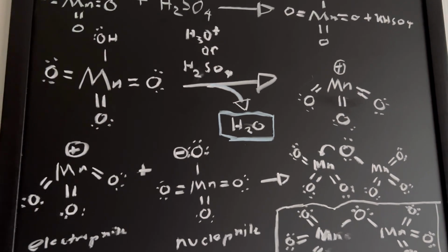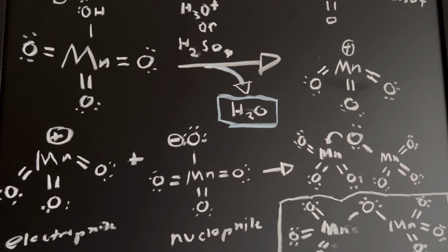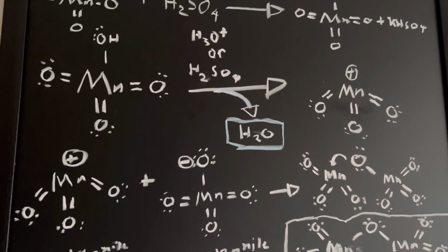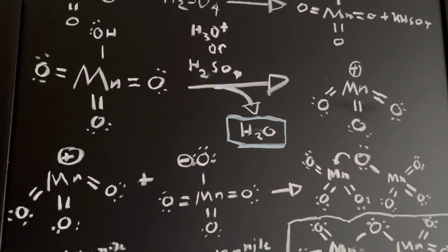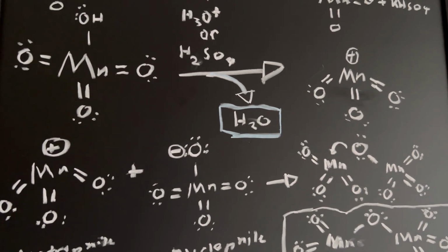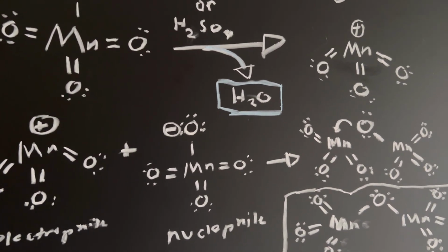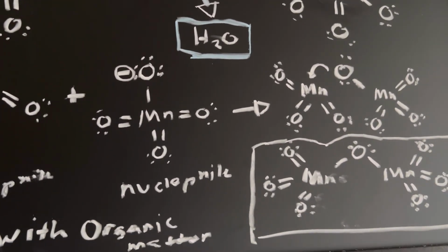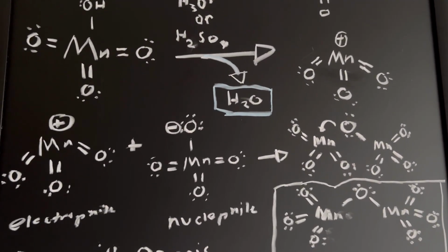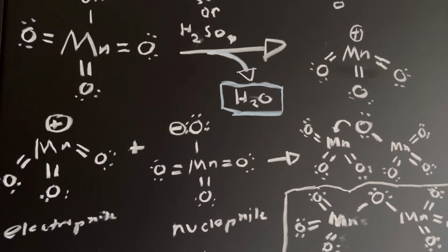So the thunderstorm experiment didn't work as I planned. You're actually supposed to see little explosions inside of the test tube. And I think the reason for that is because the potassium permanganate particles are so fine that they actually react with the isopropyl alcohol before they're able to react with the sulfuric acid to create the manganese heptoxide. I will be revisiting this experiment once I get more solid chunks of the potassium permanganate.